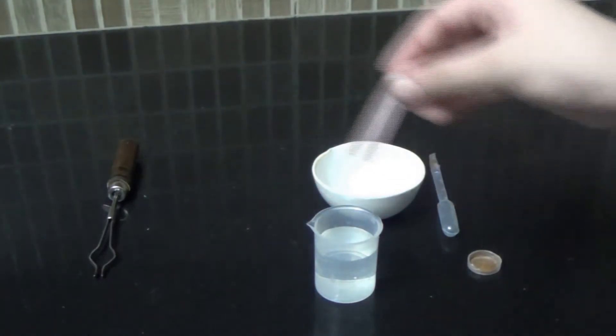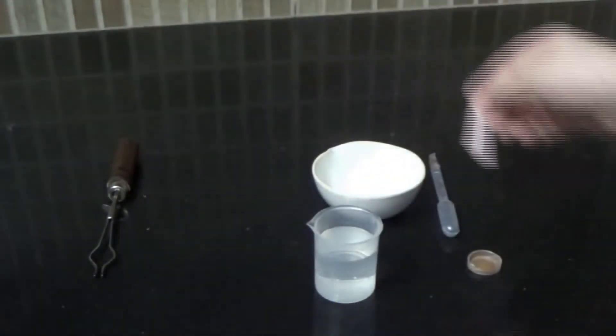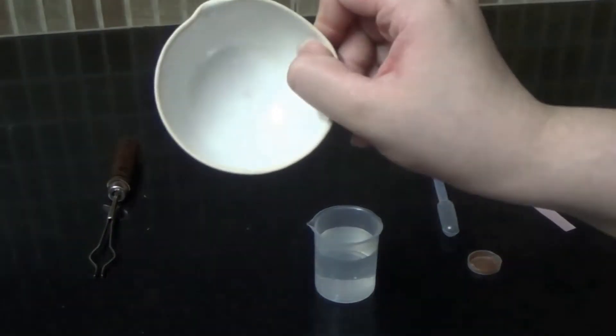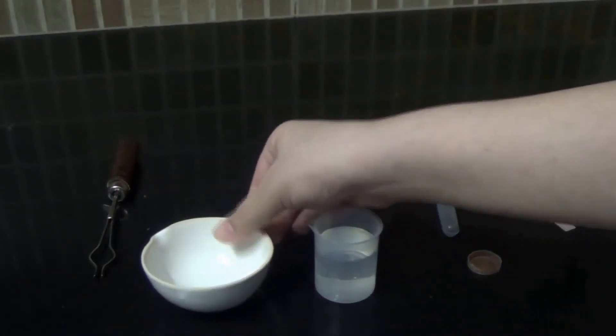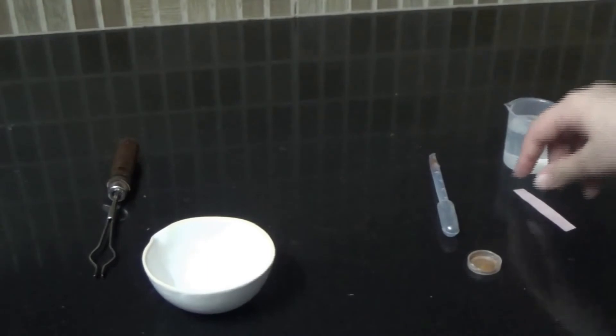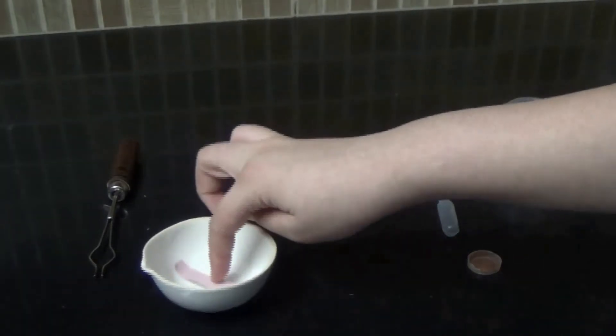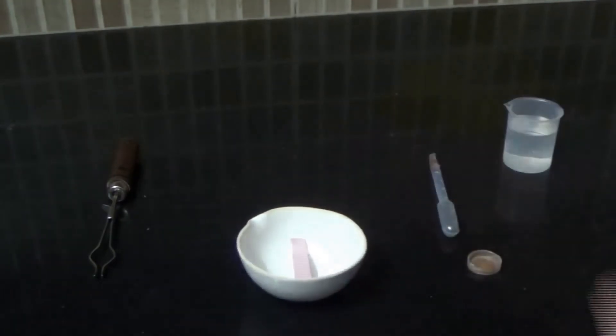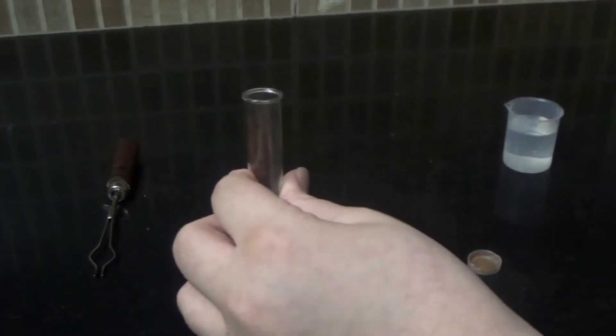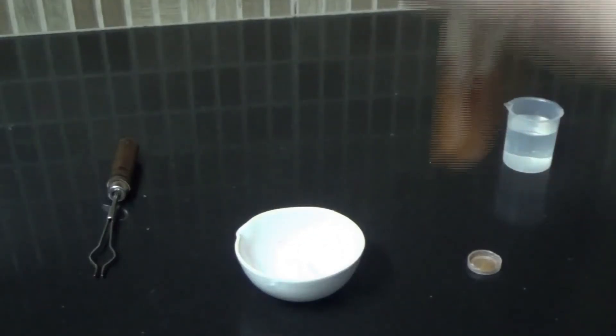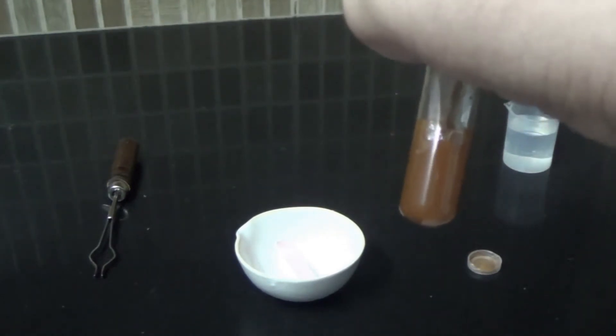Place the litmus paper inside the cup. Now add a drop of the rust solution on the litmus paper.